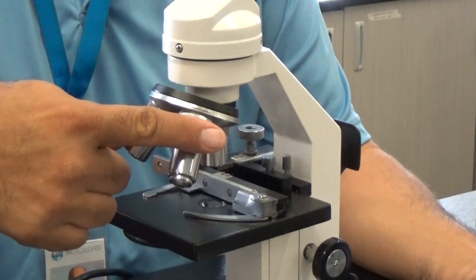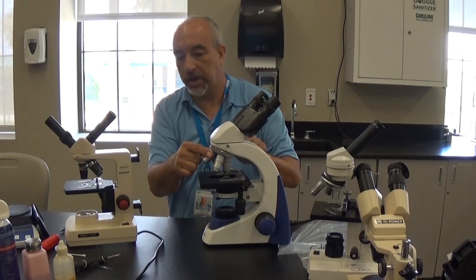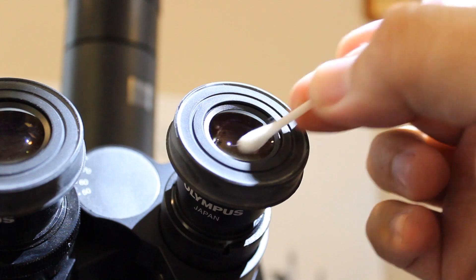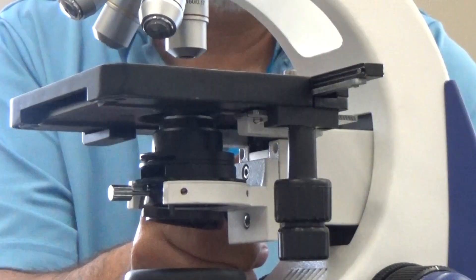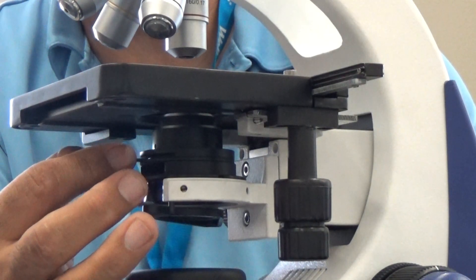We're going to clean the objectives individually. We're going to clean the eyepieces. We're going to inspect, replace, or repair power cords as necessary to ensure safety on both ends. We're also going to adjust and align the substage condenser to make sure it's all working properly.